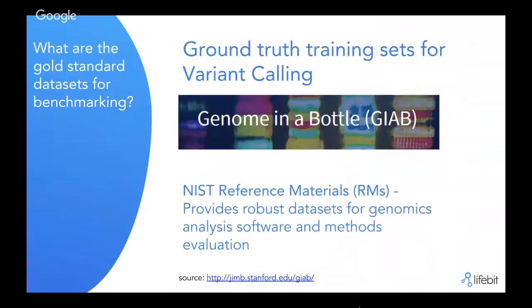After that, there is also a very important data set that is typically used first in order to develop new methods. This is quite important because if you are well aware of the latest developments in the field, you will see that it's not extremely easy to know the best tool and the right method to get the best out of your data.